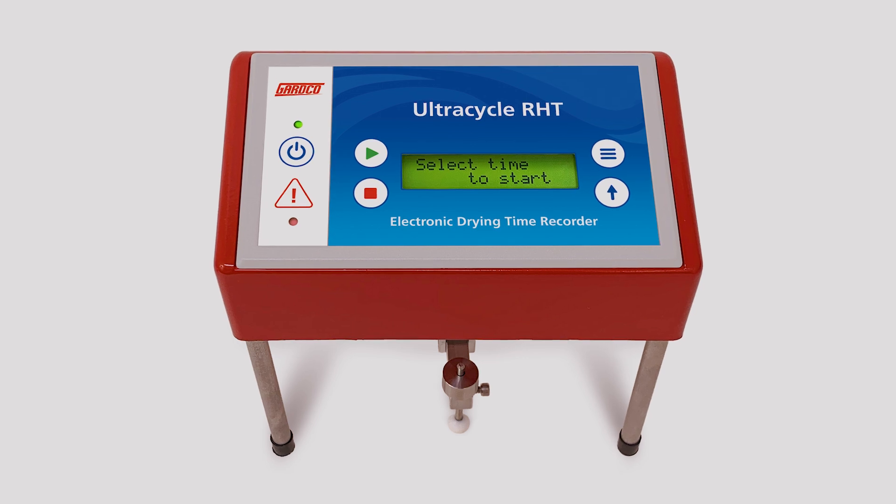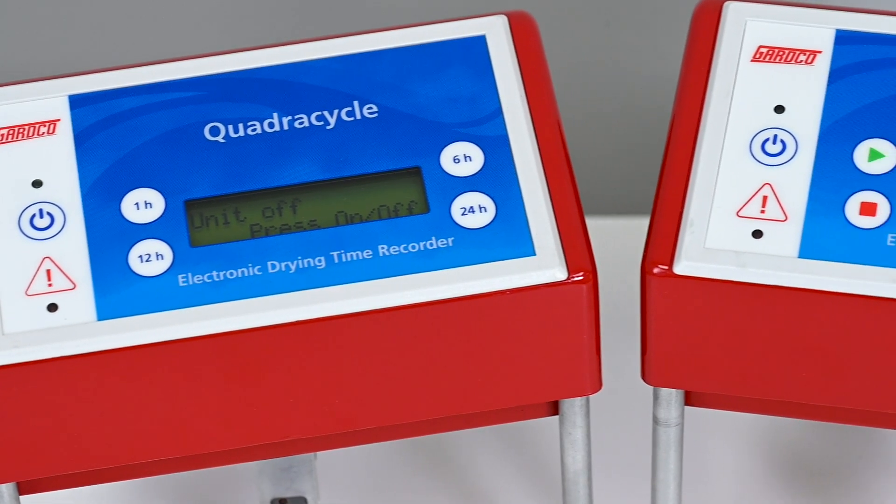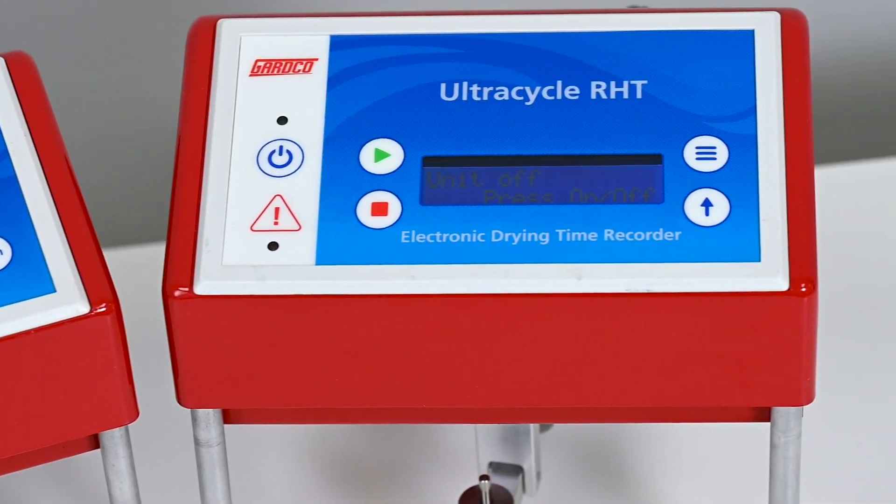The QuadraCycle and UltraCycle are GuardCo manufactured drying time recorders used to measure the drying time of paints, coatings, adhesives, and more.